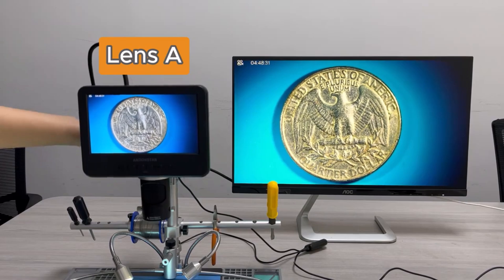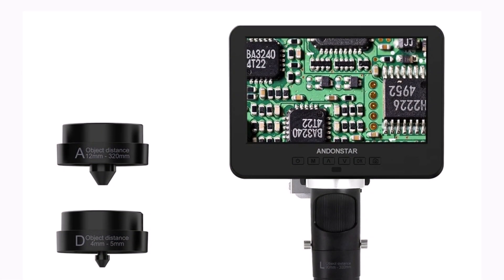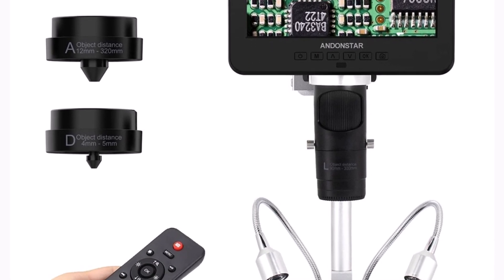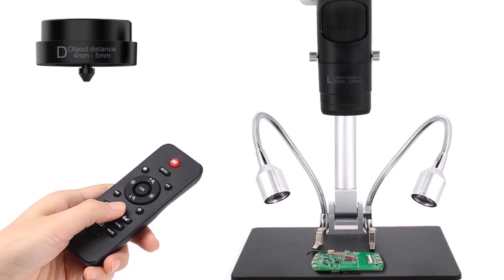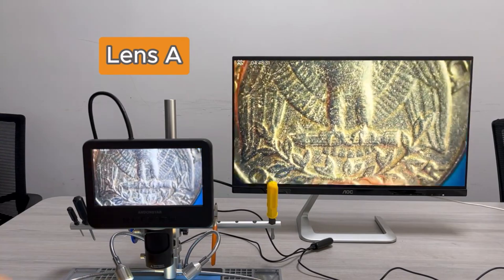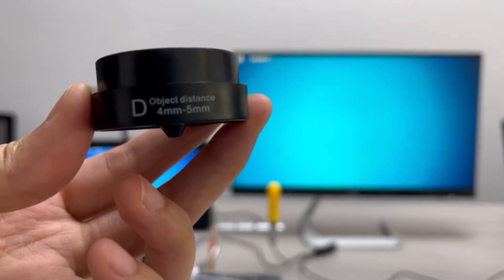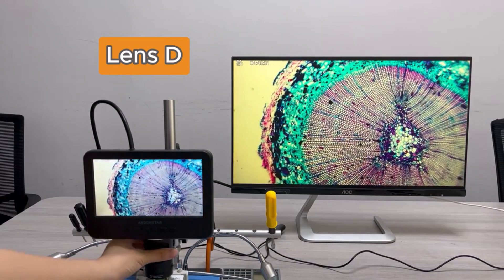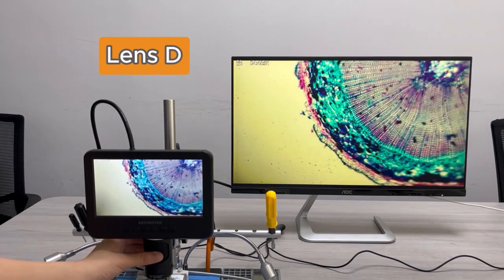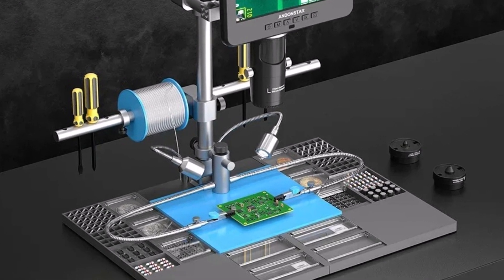It supports MP4 video recording and JPG photography with a resolution of up to 12 megapixels at 4032x3024. The 120fps frame rate under optimal brightness allows smooth visuals, making it ideal for professional use. The Andonstar AD246SM Plus is a premium choice for professionals needing extreme precision, from electronics repair to detailed crafting. Its UHD visuals, robust build, and high magnification make it worth the investment for both experts and tech enthusiasts.